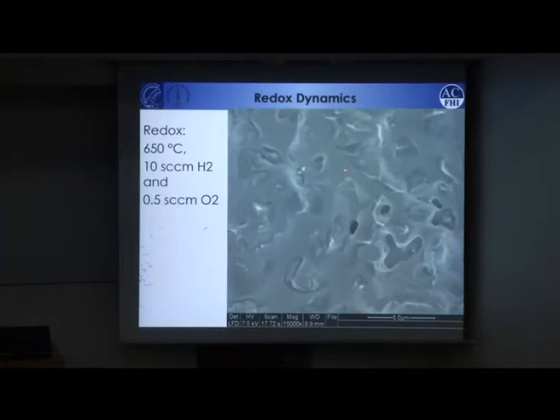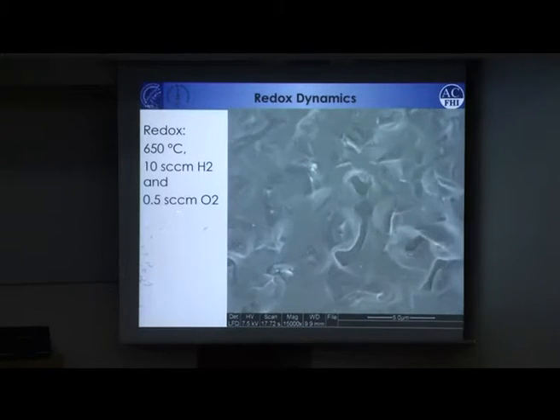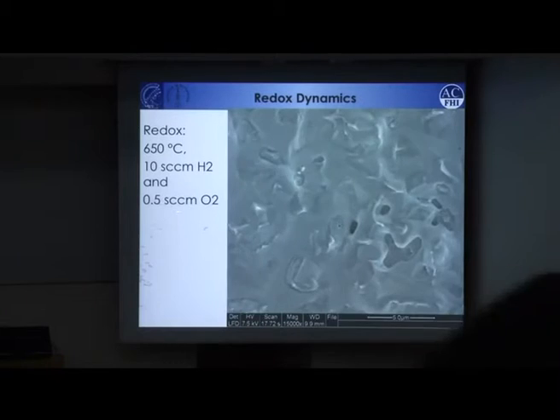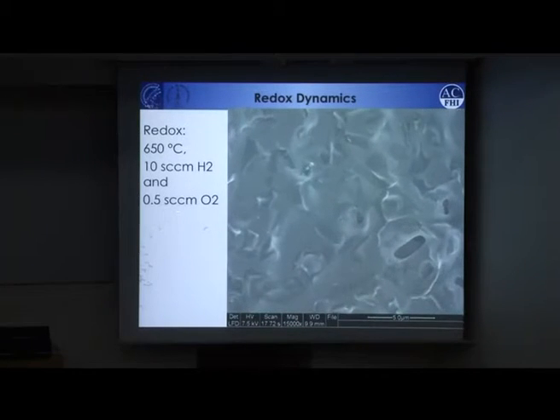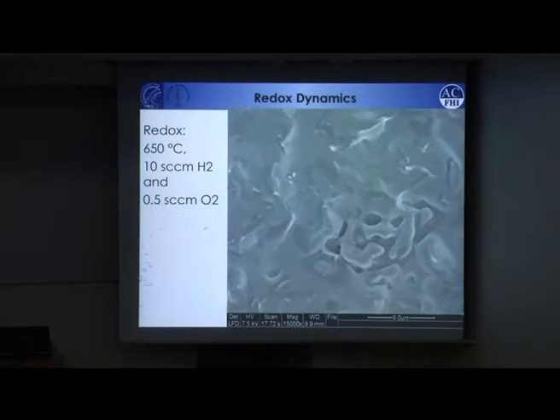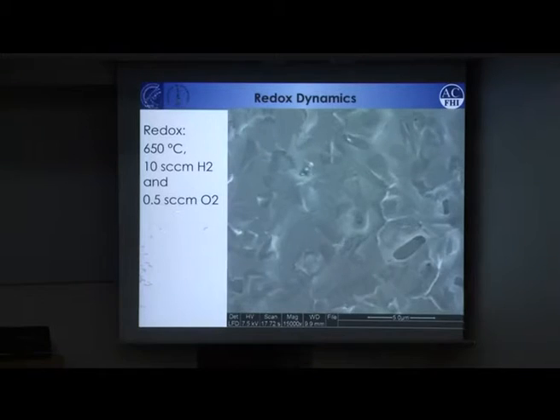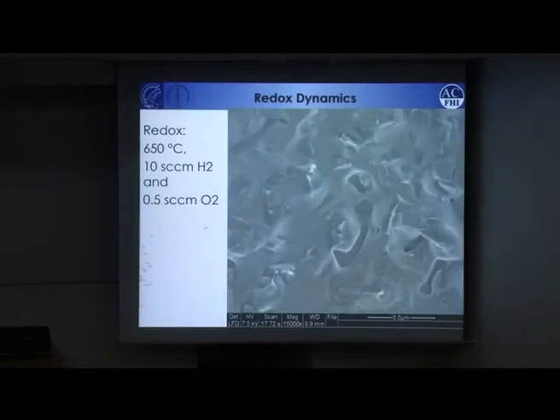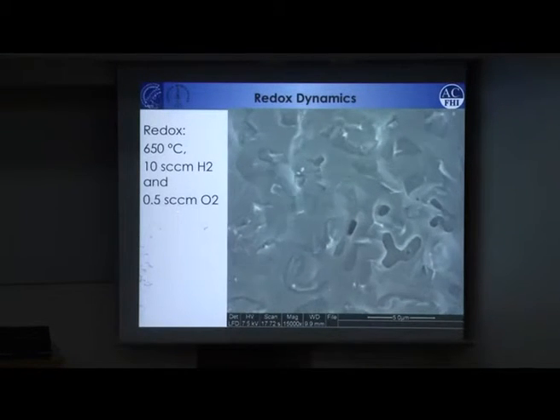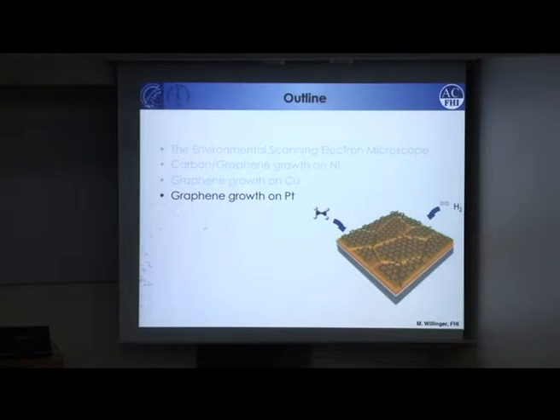So you have places where you have the copper, then you have again the copper oxide and the copper. And the reason is you have hydrogen and oxygen in the chamber, but there are different splitting probabilities for oxygen, for example, on copper and on copper oxide. And actually it doesn't need much, but it starts to oscillate. It's very beautiful. So we are trying to study this as a function of temperature and oxygen partial pressure. And the good thing is, when you just do in-situ spectroscopy, you have the conditions and you record spectra. You see different copper species, but you wouldn't see the dynamics. But we can now do these experiments under exactly the same conditions as the spectroscopists, and we deliver the visual information. So then we can tell you, look, it's not just one strange copper phase, it's actually phase separated into different types of copper.